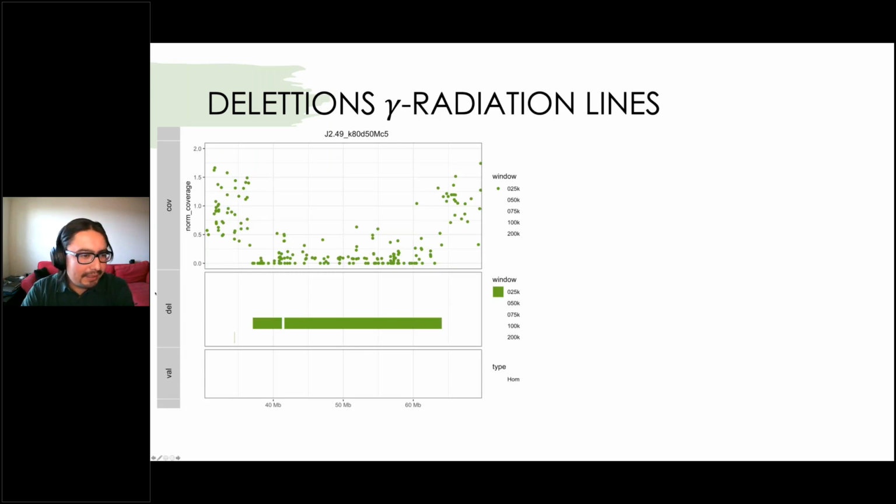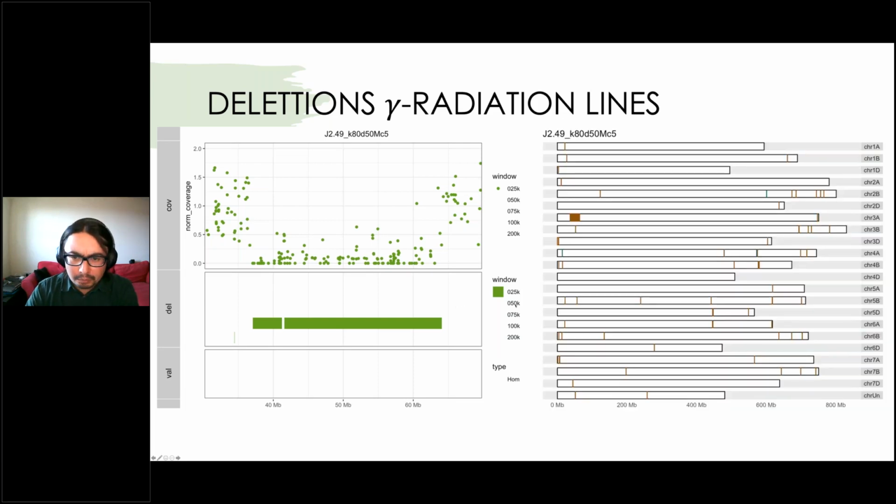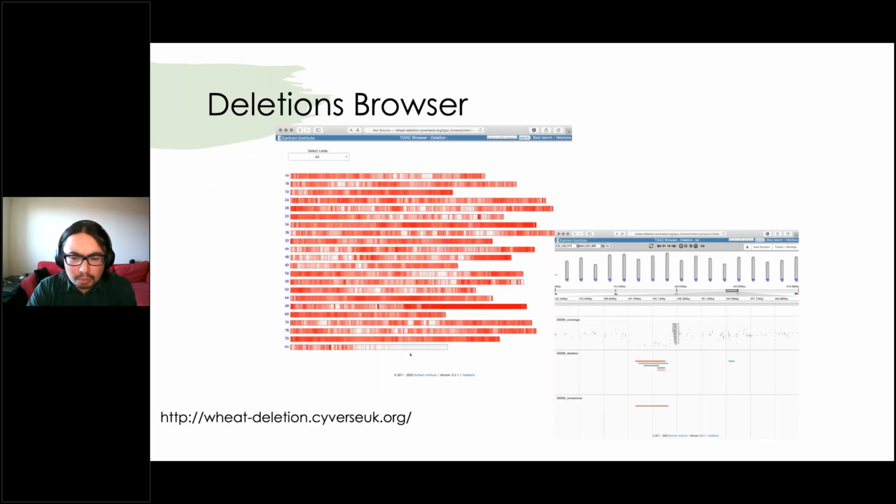And the original data that we get, when we normalize it, has a lot of coverage variation, which is fine, but we get these regions with almost zero coverage, and we want to know if these are real deletions or not. And we have this for the whole chromosome. So we have large deletions and small deletions. And of course, the problem here is, are these deletions real, or is this just an artifact of the sequencing? But anyway, we have these lines available for people to order on the deletions website. But yes, as I was saying, we want to confirm that these deletions are real.